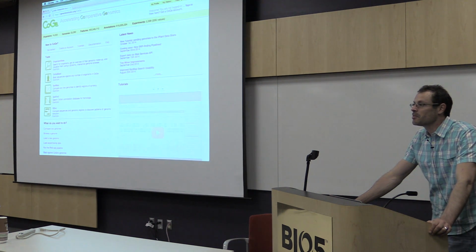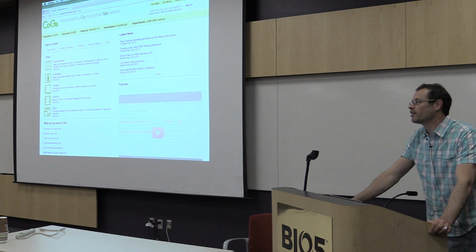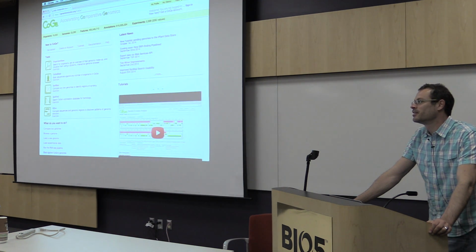Once everybody's at genomeevolution.org, just raise your hand. Give me a visual cue to let me know that you're all in the same spot. Of course, the slackers are up here on your front left. We don't know what they're doing.